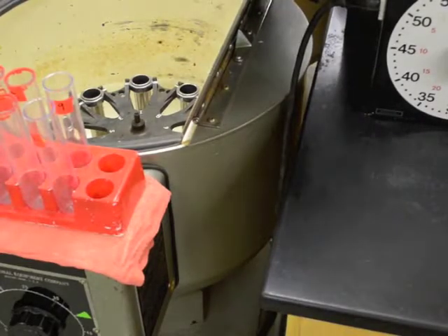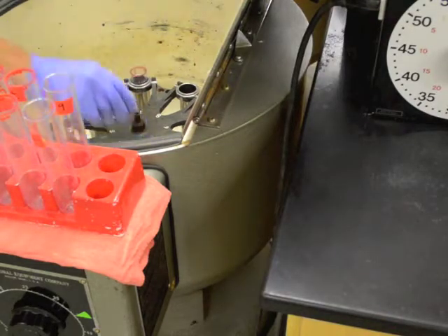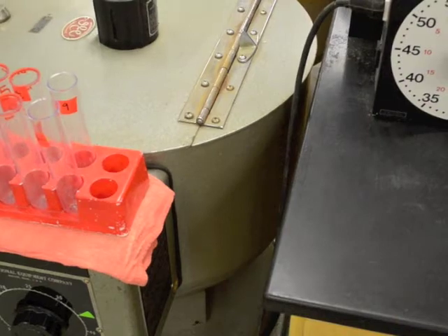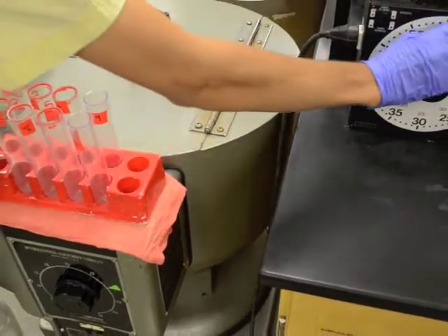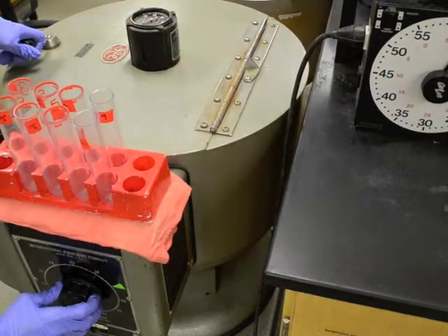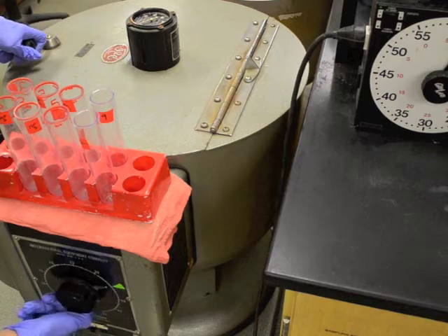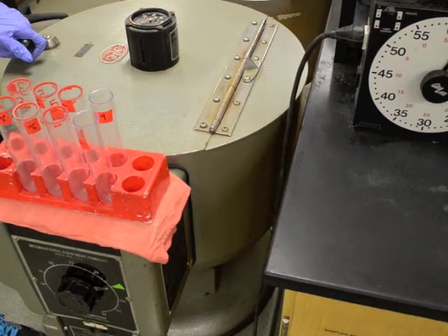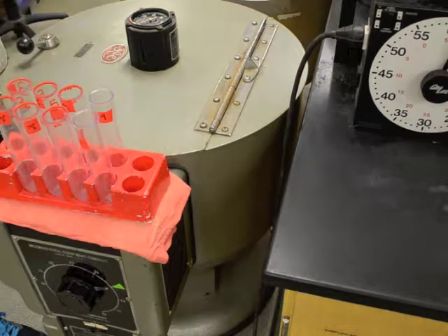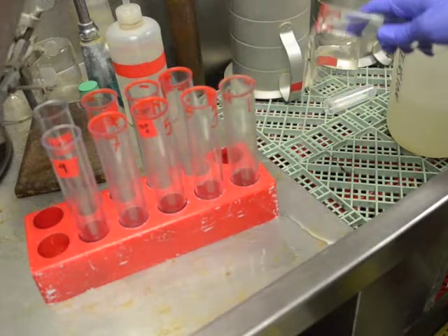Centrifuge the samples at 3500 RPM for 3 minutes, allowing extra time for the centrifuge to reach top speed. After centrifuging, gently pour off the supernate from the sample.